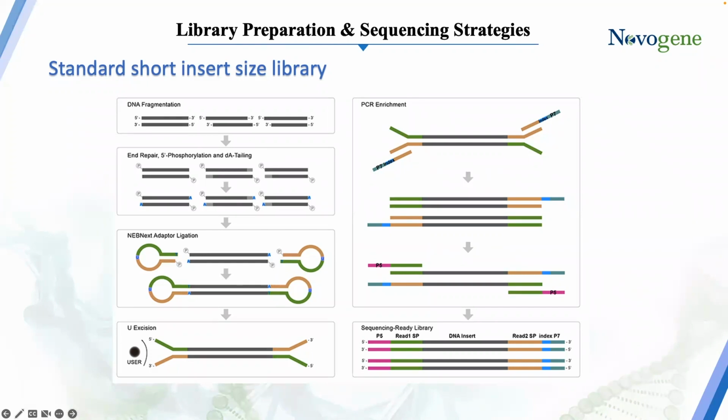This process, you're going to start with your gDNA sample, your genomic DNA sample. You're going to fragment it under conditions that favor 300 to 600 base pairs approximately. This is going to yield you two different types of products. You'll get some blunt-ended products. You'll have others that have hanging ends. And so you need to perform end repair so that we have all blunt-ended fragments.